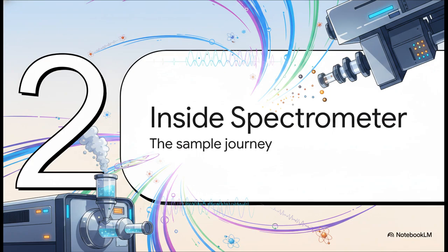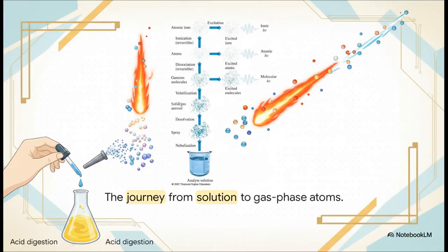Moving on to Section 2, Inside the Spectrometer. Let's see how a physical sample actually gets transformed and measured inside the hardware. The journey our sample takes is practically a masterclass in physical chemistry all on its own.